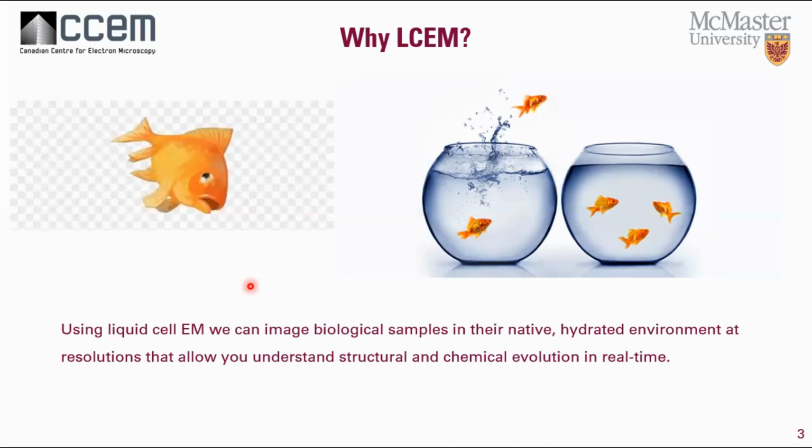These methods immobilize the sample, making it impossible to observe real-time dynamics. In-situ experiments like liquid cell microscopy give another dimension by observing events live. Getting to understand dynamic events at the nanoscale gives control to understand the structure of the materials.